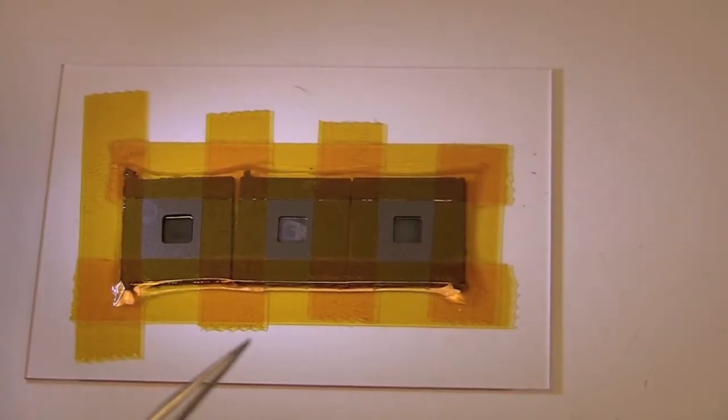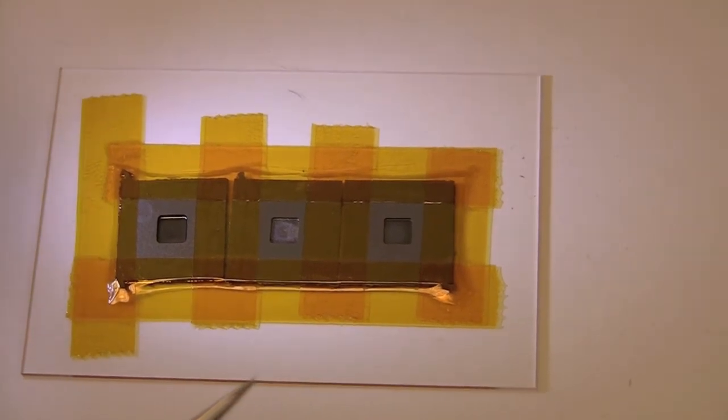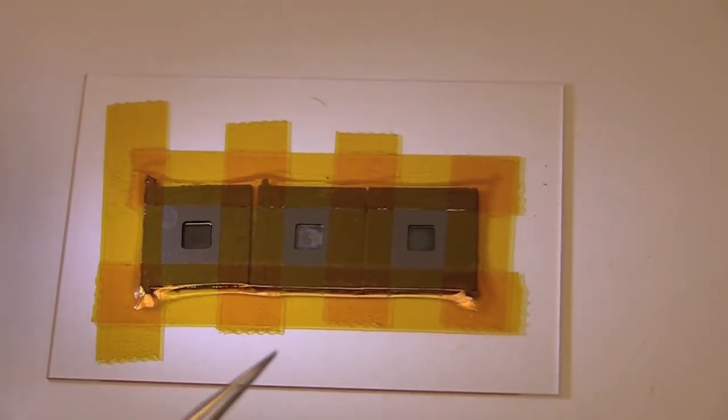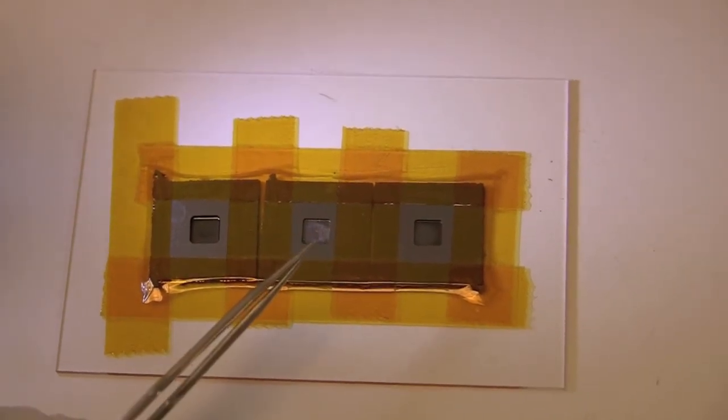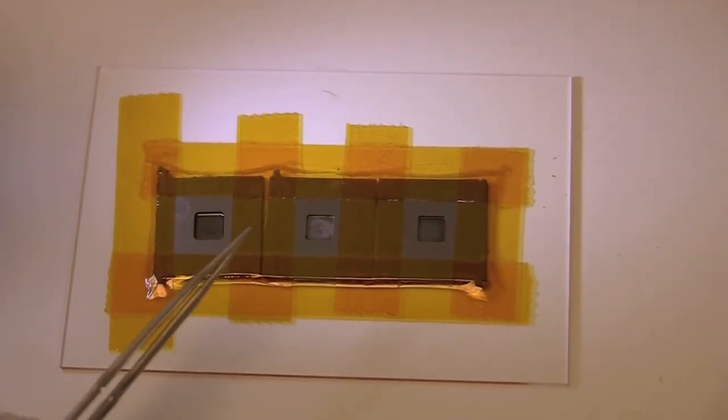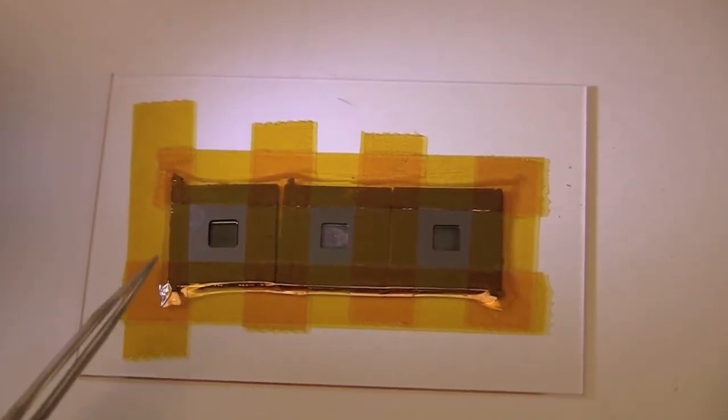Now earlier, I showed you how to prepare a sample for our xenon difluoride machine. This is a sample that's been run through the machine, and I wanted to point out a couple of things about this. As you can see, this middle device here looks a little different from the left and right. That's because it's etched a little more than the other samples.